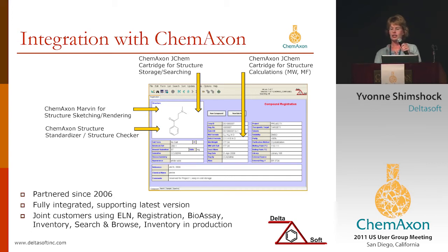The ChemAxon cartridge also would generate structure calculations, formula, weight, names, properties, and so forth. And if you wanted at the end of the day to export all of your data out of the ChemCart form, you could certainly import that to a JChem for Excel report.